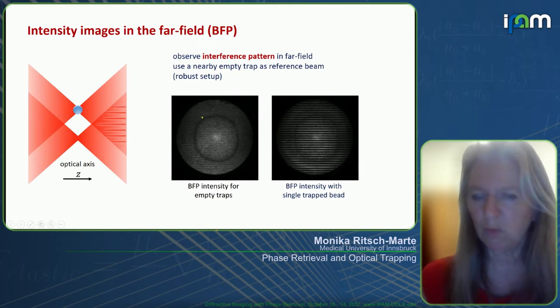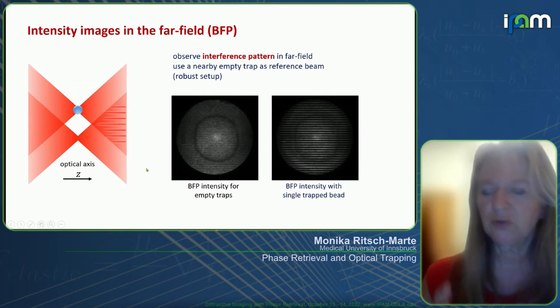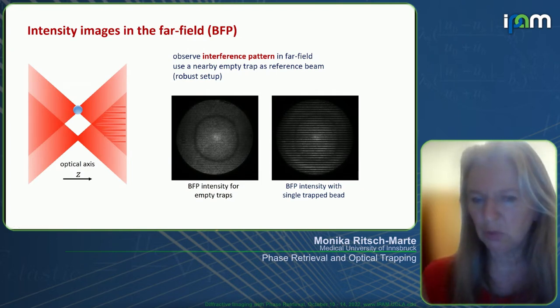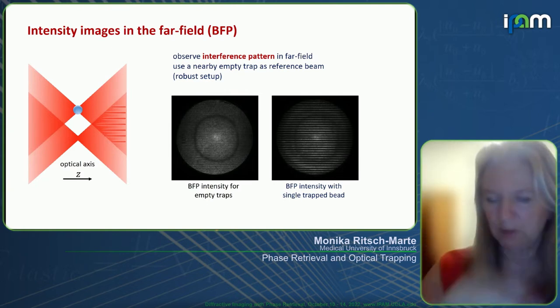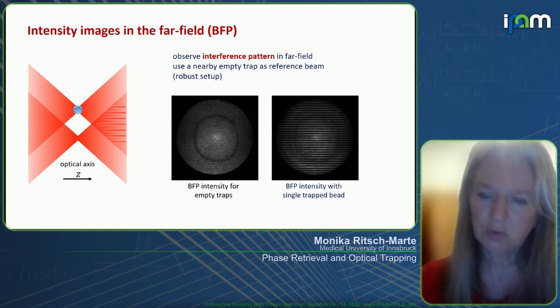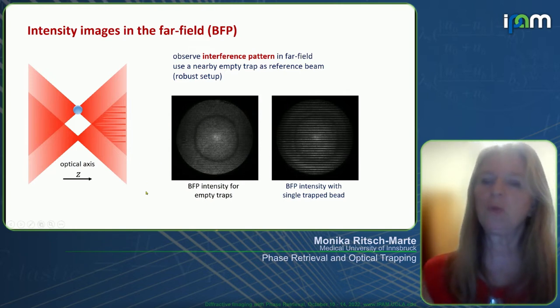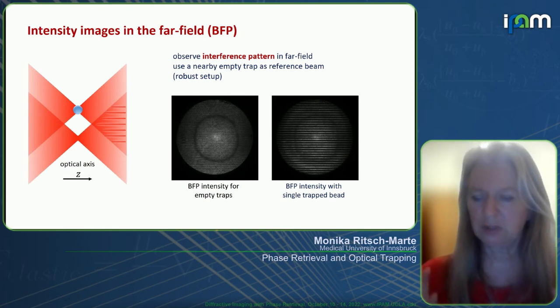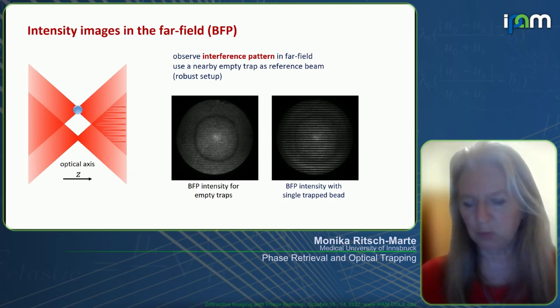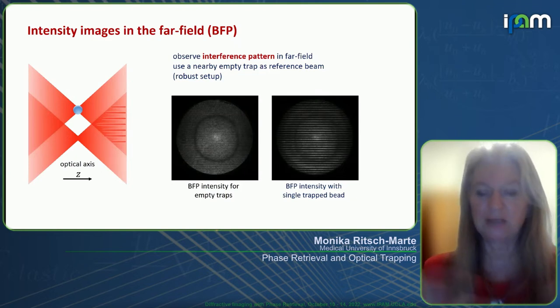Now you would say, what are these structures that we can see here? This is a kind of dark field imaging that we do here. We are closing an aperture stop somewhere further below before the objective to make visible some effects that we have here from the SLM. If we open the full aperture stop as wide as we can and we collect everything that is coming from the SLM, which does a pure phase, a phase shifting pattern only, then we would just have an image of a transparent phase pattern.